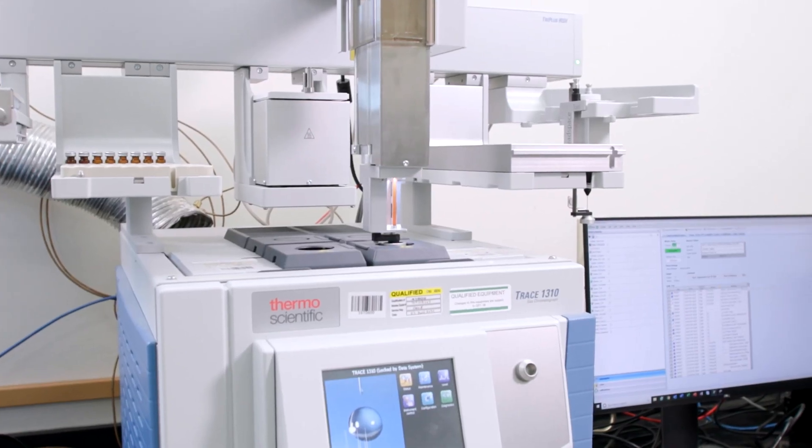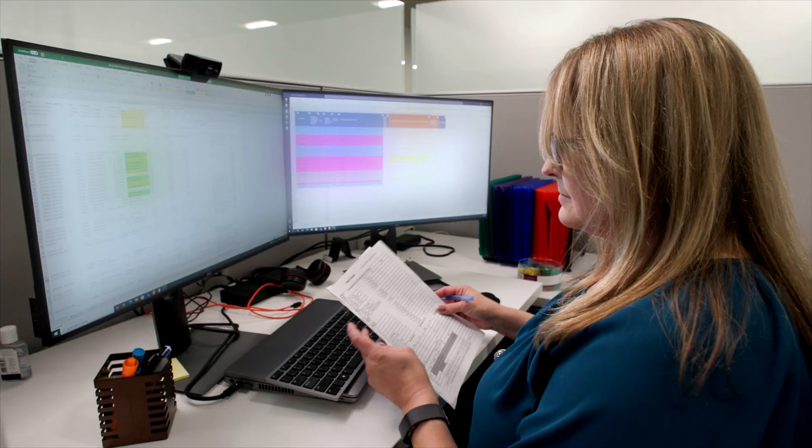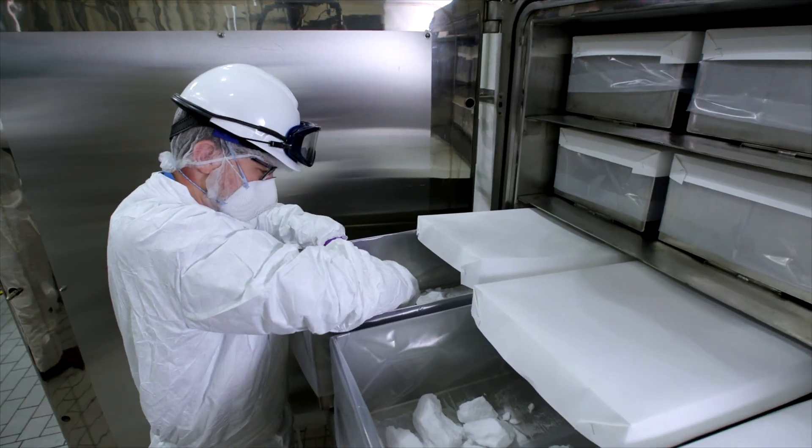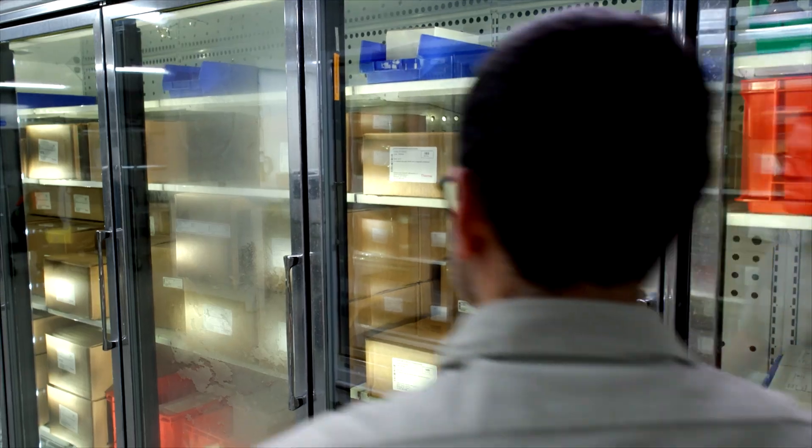Quality is part of the entire process, from entering orders through manufacturing and QC testing, to packaging and shipping, to deliver consistent products that meet your specifications.